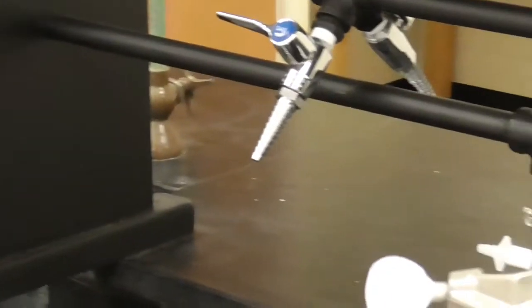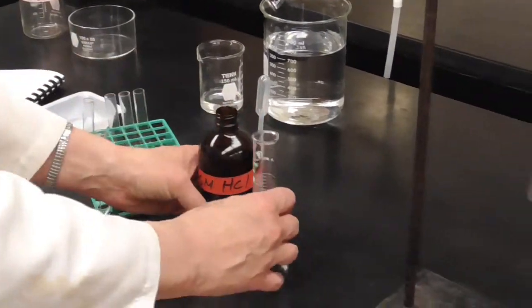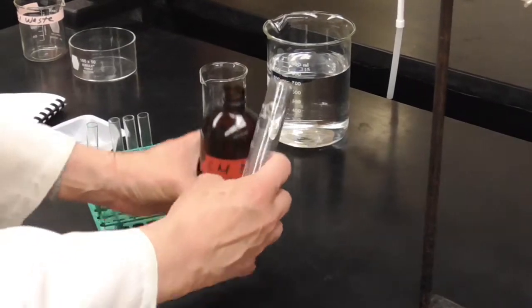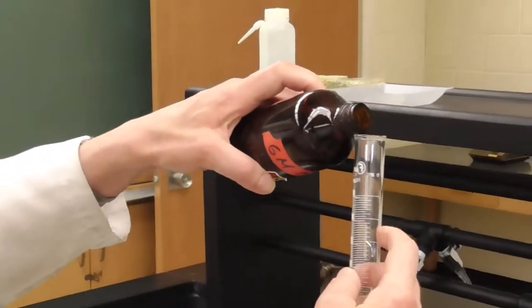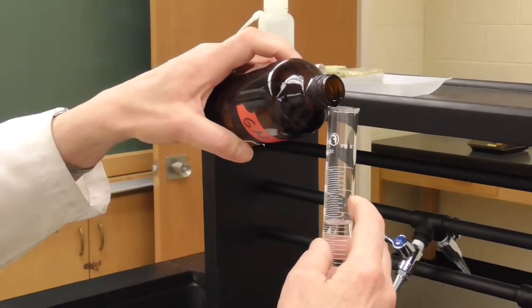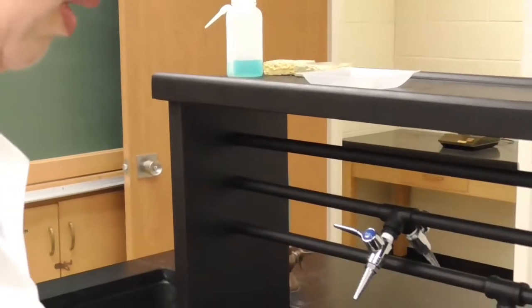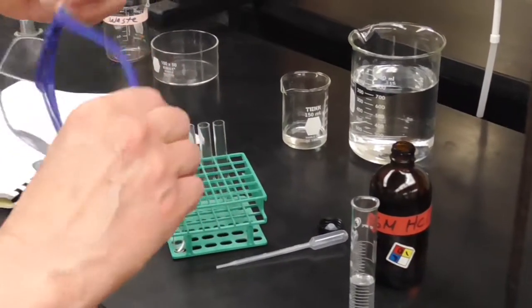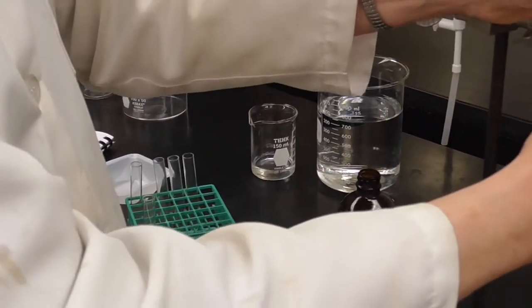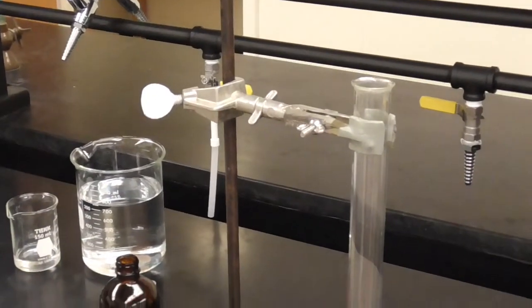And now I'm going to put 15 milliliters of 6 molar hydrochloric acid. First I measure it into a graduated cylinder, and then I'm going to put that into the large test tube that is mounted on this ring stand.